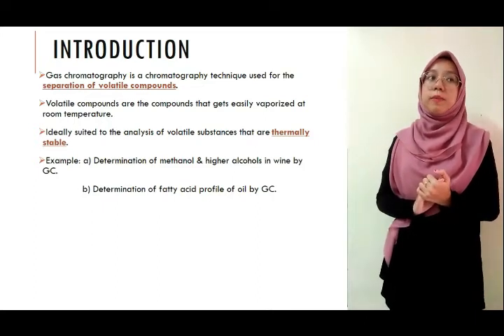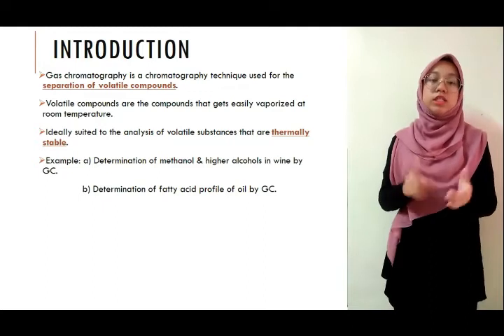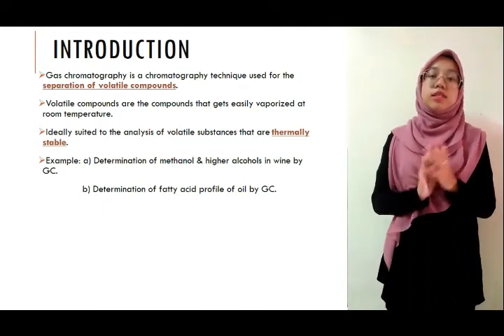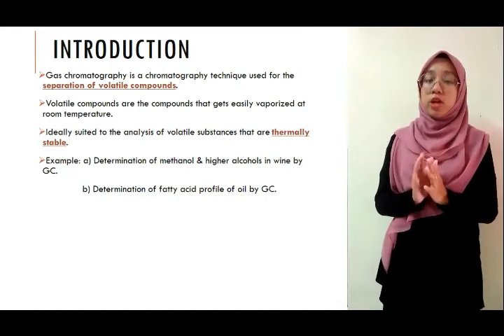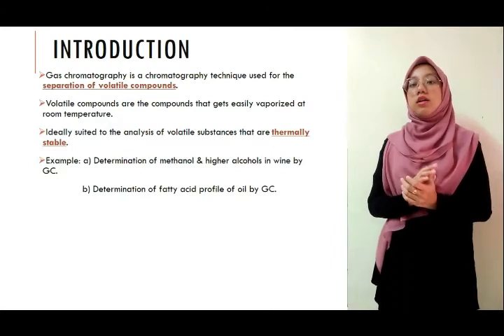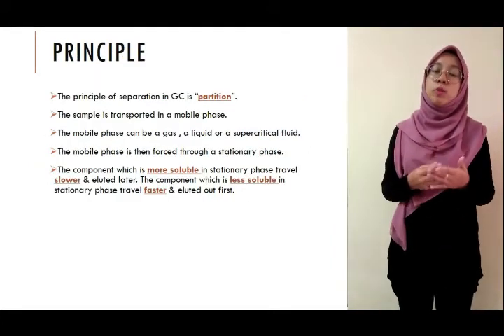There are many applications of GC in the food industry. For example, the determination of methanol and higher alcohol in wine production. Next, the determination of the fatty acid profile of oil in GC. Okay, next, we will move to the principle of gas chromatography.